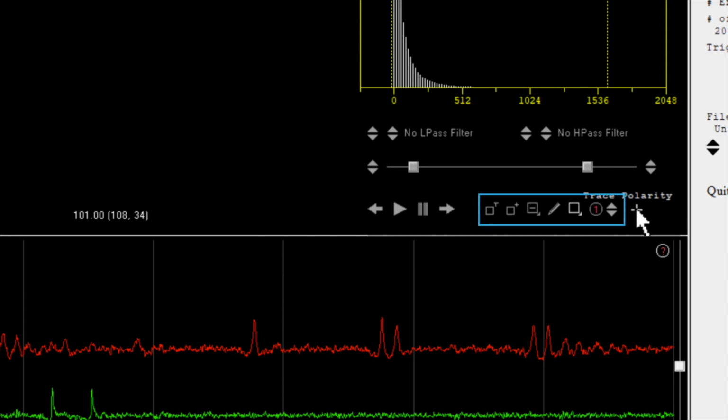This section has tools for selecting regions of interest. Click Kernel allows you to select, by single click, circular regions of interest with diameter in pixels defined by the red number inside this circle. You can change the diameter with these two arrows. Drag a box to draw a rectangular region of interest. This mode is currently selected, and therefore the text is in red when the cursor is hovering over it. The button of the selected mode is always highlighted.